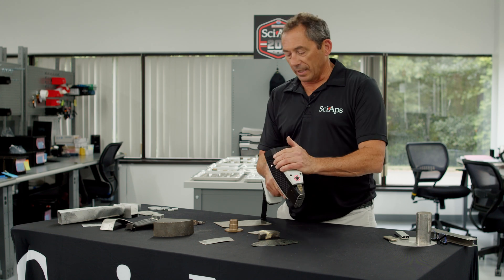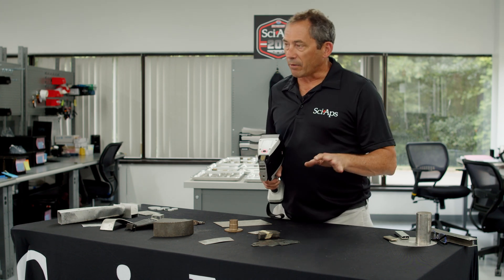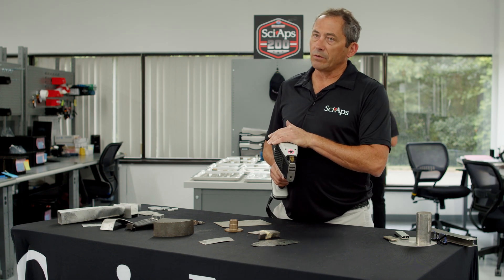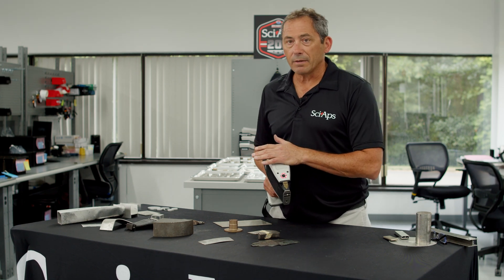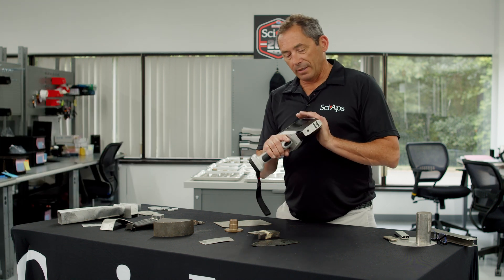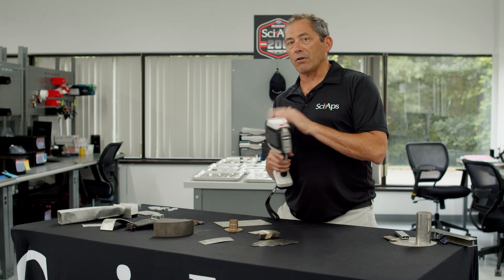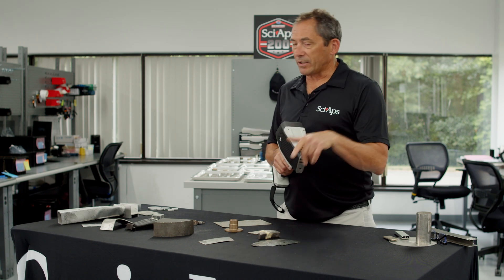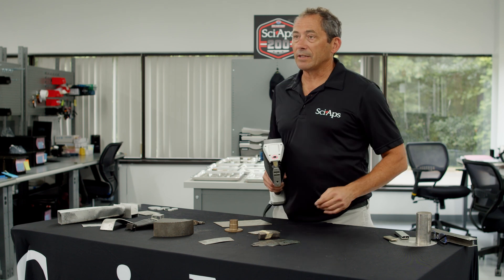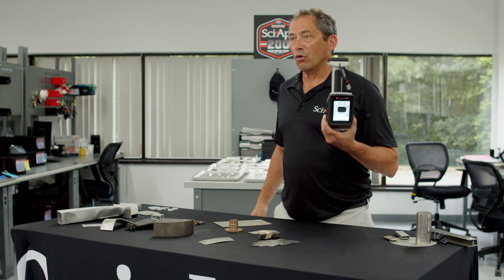A couple of other things to note about the Z70. First of all, we've really eliminated the drift correction. Some of the older LIBS models, you had to drift correct sometimes multiple times a day. We've stabilized the laser temperature with a new method and you don't have to do that at all. As you might've watched, I turned it on and we started shooting — we didn't do any drift correction and we got good results. So another benefit is no drift correction.